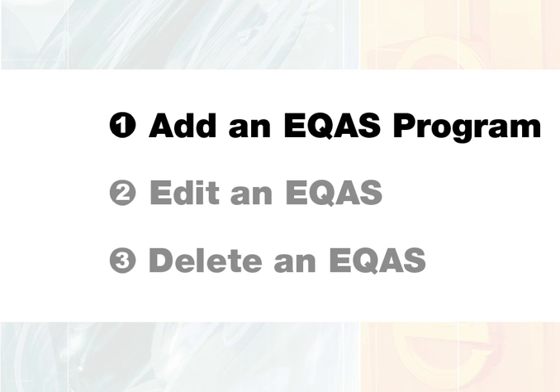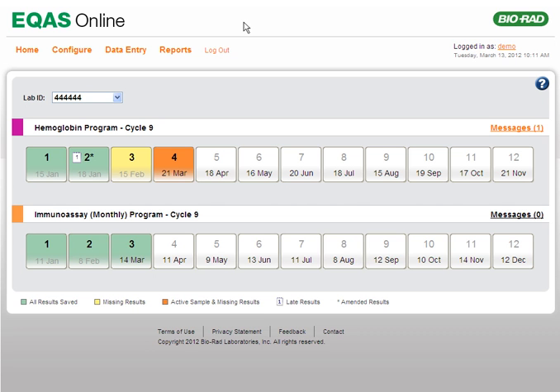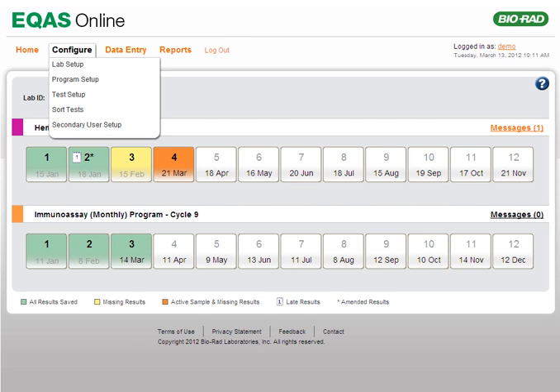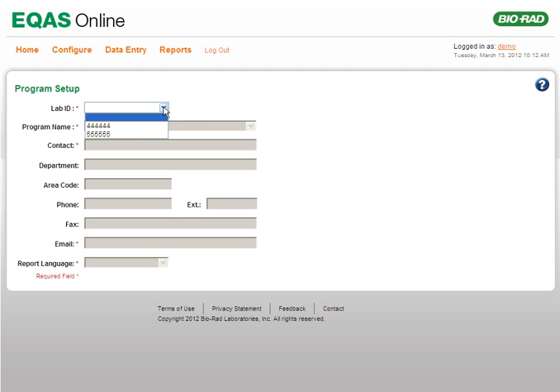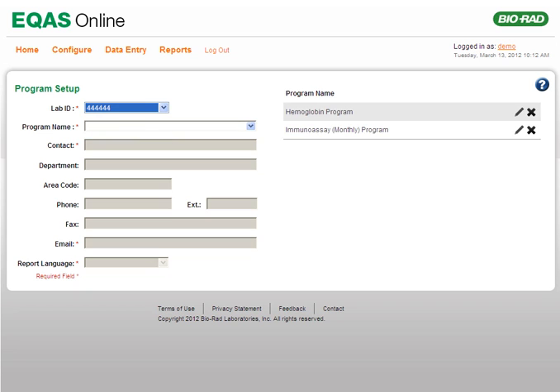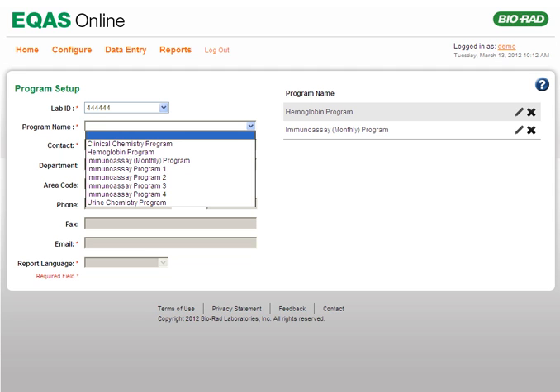To add a new program to a lab, select Program Setup from the Configure menu. On the Program Setup page that opens, your lab ID is selected automatically in the Lab ID list. If your lab has more than one lab ID, select the appropriate ID from the Lab ID list. Select the appropriate program from the Program Name list.